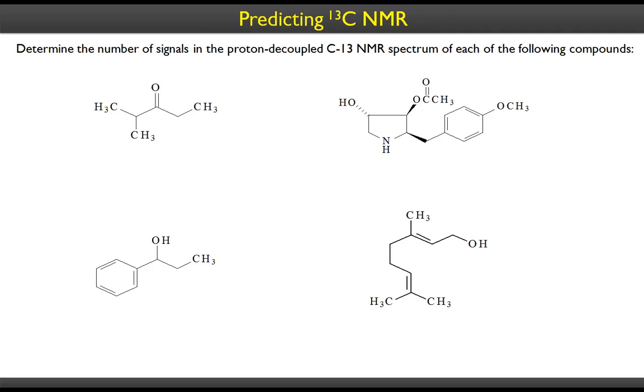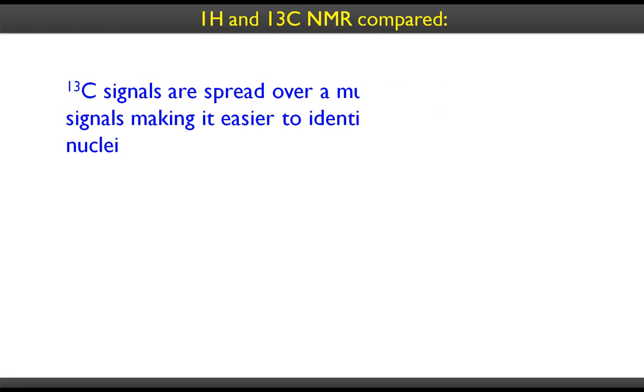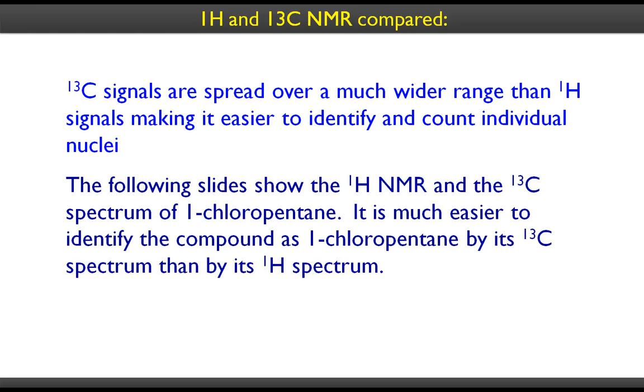Okay, so anyhow, try and solve this slide and find out the number of signals in a proton decoupled C13 NMR spectrum. We will talk about what is called proton decoupled C13 NMR. So let's compare the two tools that we have been learning once again here.